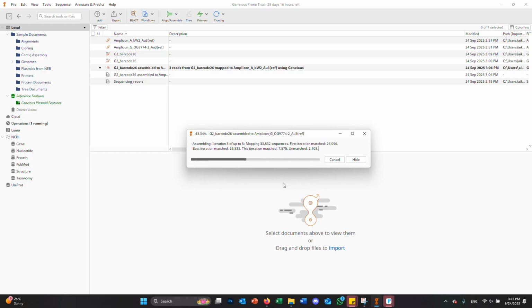But a really simple way to determine how similar they are to each other is to generate a quick tree. Now, I realize this is not the right way to teach you phylogenetics because this is a really limited data set and there are a lot of different steps involved in making a good phylogenetic tree. But I often use a tree to help summarize data in a quick and easy way. When you're looking at an alignment of 1,000 bases and trying to say which one is more like the other, it's really hard to tell by just looking at the nucleotides. So you can use tree building software to basically tell you the similarities for you.